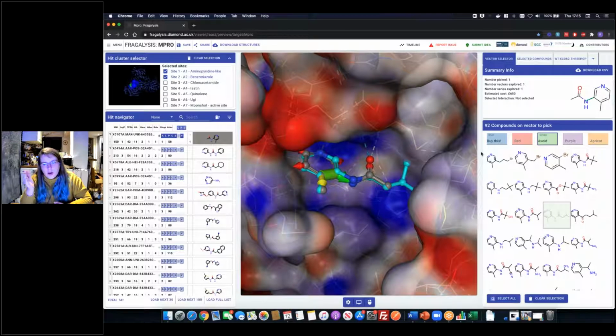Because we don't have the intensive algorithms on the back end, and this is just a guess at what we could do, we have a feature where you can import computational data and visualize the structures, which is probably more robust anyway. But yes, it's a good idea for a feature.